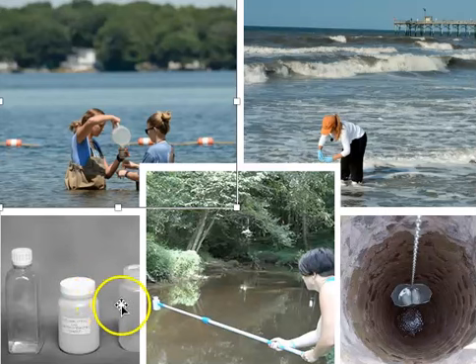You'll notice too that the plastic material differs from container to container. That's often depending upon which company you purchase these containers from. But they arrive sterile, and with the correct aseptic technique, the sample can be collected and taken to the laboratory without any further contamination.